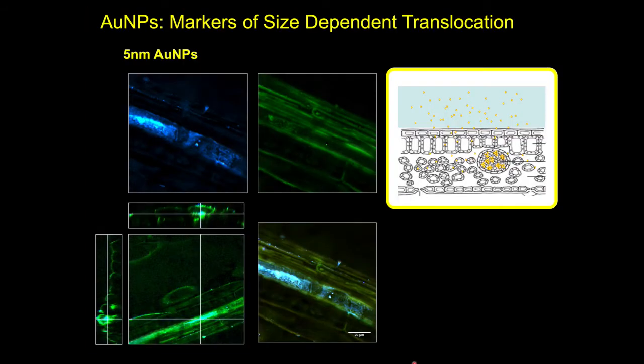We've done some work exploring the size-dependent uptake of agrochemical particles through the roots. To explore this, we used the excited state absorption signal from gold nanoparticles. We use the gold nanoparticles as models for particles of agrochemical compounds. Whereas before, in the chloroplast, we were trying to exclude the excited state absorption, this time we're using the excited state absorption that comes from the plasmon resonance of the gold particles as a marker to show whether we have uptake into the root.